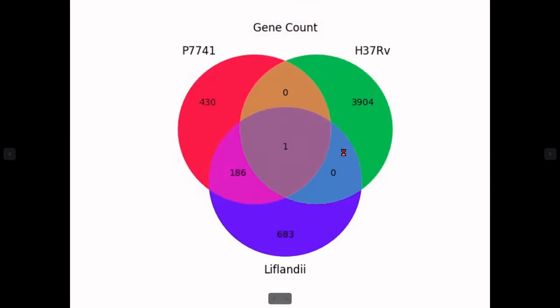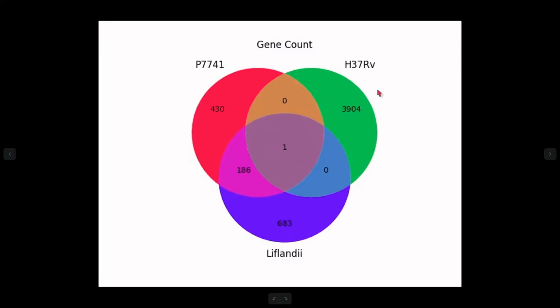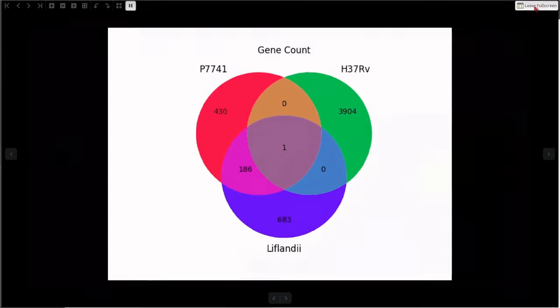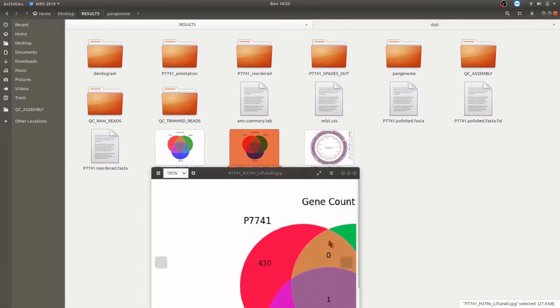The next Venn diagram compares with H37Rv. This is interesting: 3,904 genes were unique to H37Rv, which explains why it was clustering separately in both the dendrogram and the pangenome matrix. P7741 and H37Rv shared no genes in common, and there's only one gene that was common among all three. This shows how distant the relationship is between H37Rv and P7741, providing a lot of insight into bacterial genome analysis.